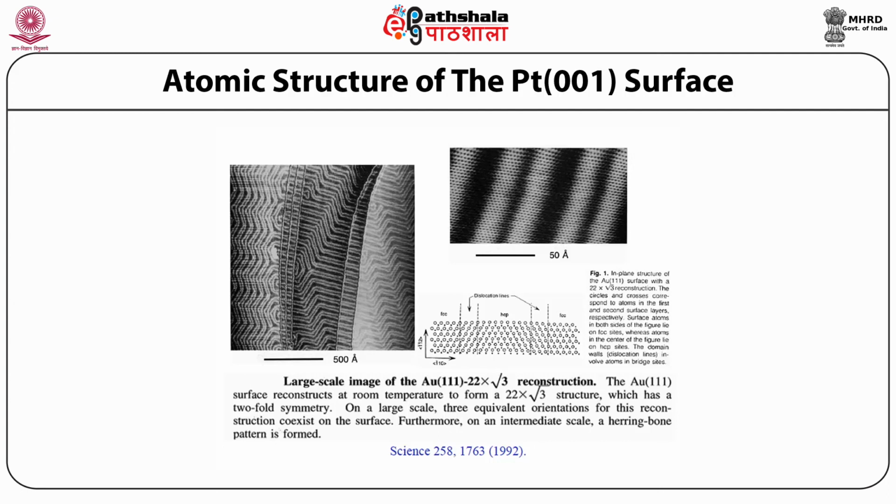So on a large scale, 3 equivalent orientations of this reconstruction coexist on the surface. Furthermore, on an intermediate scale, a herringbone pattern is formed.